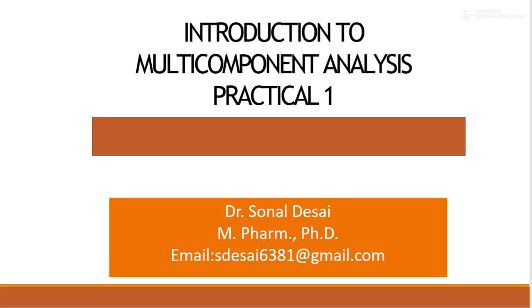Today we will discuss the practicals of the subject Pharmaceutical Analysis 5. To start with practical number 1, that is introduction to multi-component analysis.